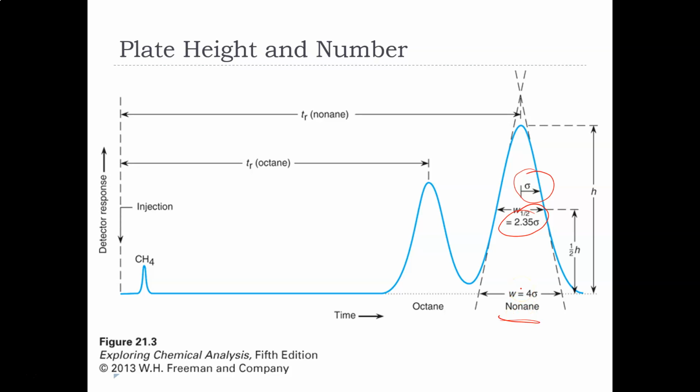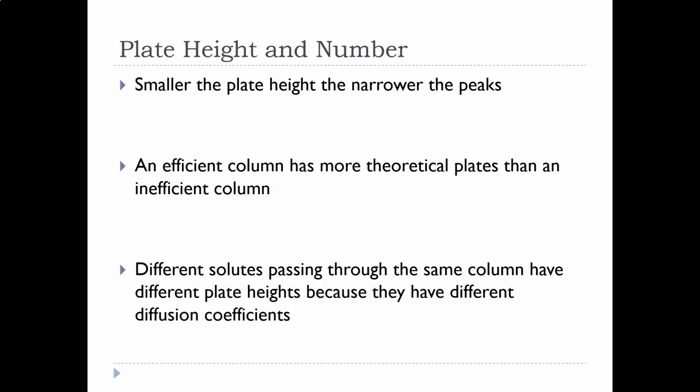And then based on this information, we could solve for the number of plates in a column. And the reason why that's an important thing, well, I take that back. Let's go forward a little bit more, and then we'll talk about why the number of plates matters, why anyone cares. Okay, so first, relationship.